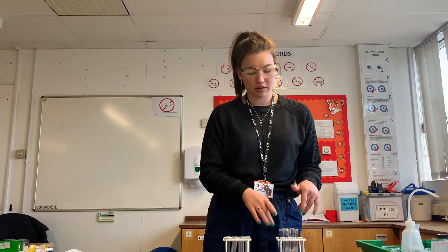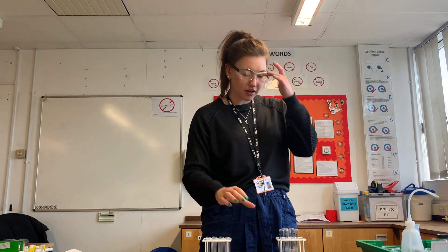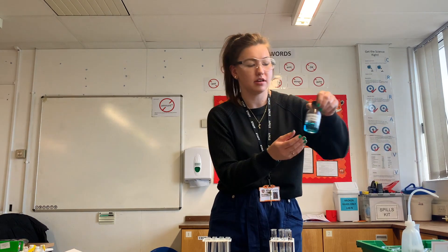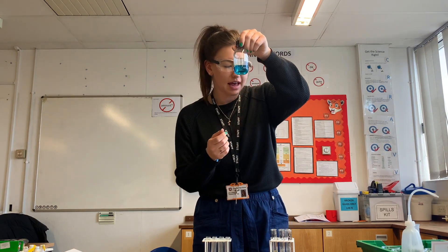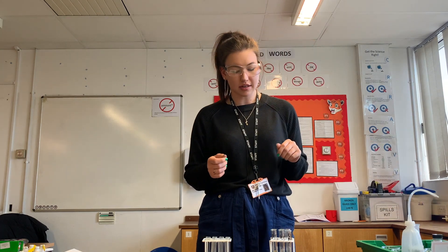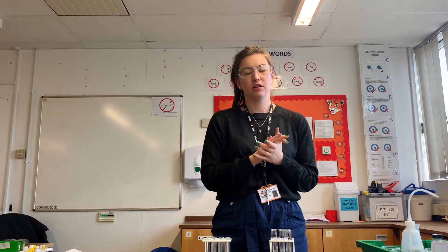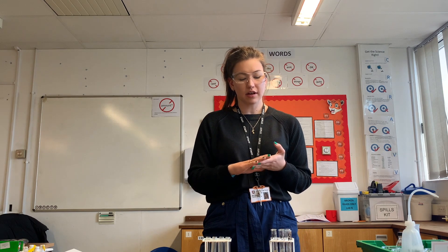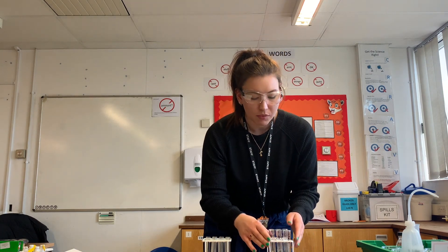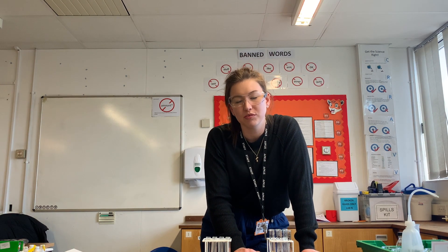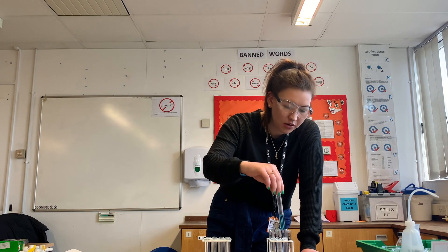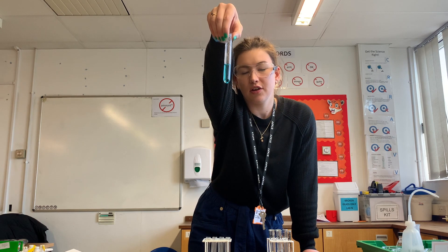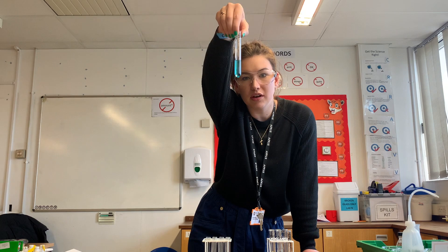Our instructions say to stand these in a rack to cool a little bit. While that's happening, I'll explain what's gone on here. Our Benedict's solution started off a nice blue color because it contains copper Cu²⁺ ions, which are blue. When glucose is present in your sample, those Cu²⁺ ions are reduced to Cu⁺ ions, which form a solid precipitate. The more glucose is present, the more precipitate is formed and the less blue your solution will be, because those blue Cu²⁺ ions have been reduced to Cu⁺. Where we have no glucose, we still have blue Benedict's solution - none of those Cu²⁺ ions have been reduced and no solid precipitate is formed.